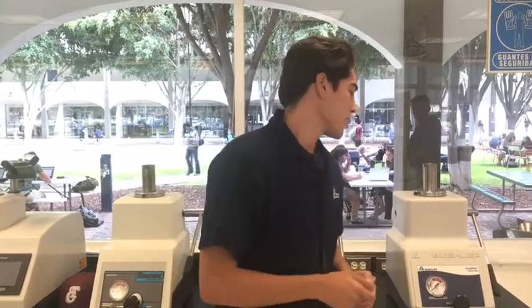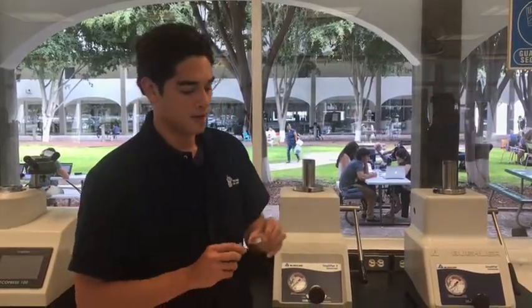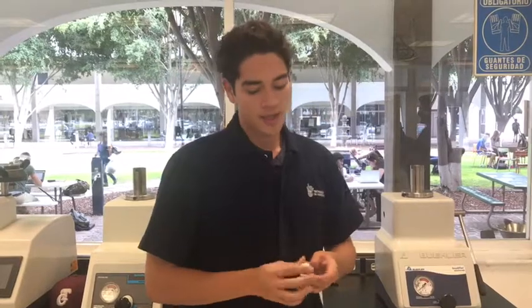Then we are going to pass to the mounting press. We have to put in there bakelite, and also a sander for the sample. Then we have to move to the microscope to see the details of the material, to check the properties and the number of grains we have in the material.